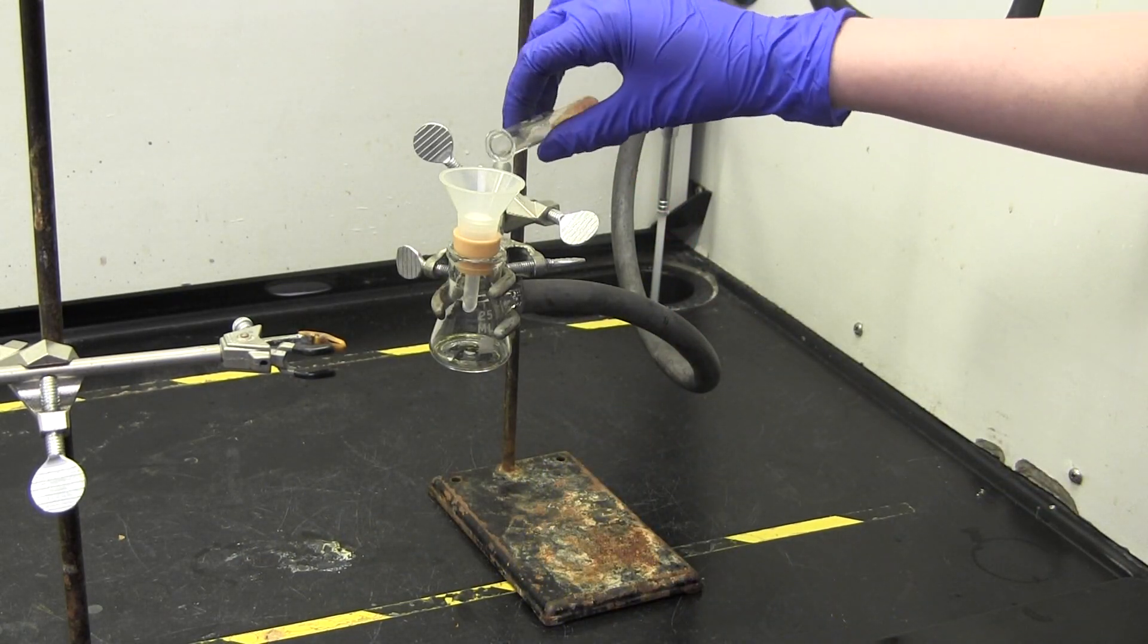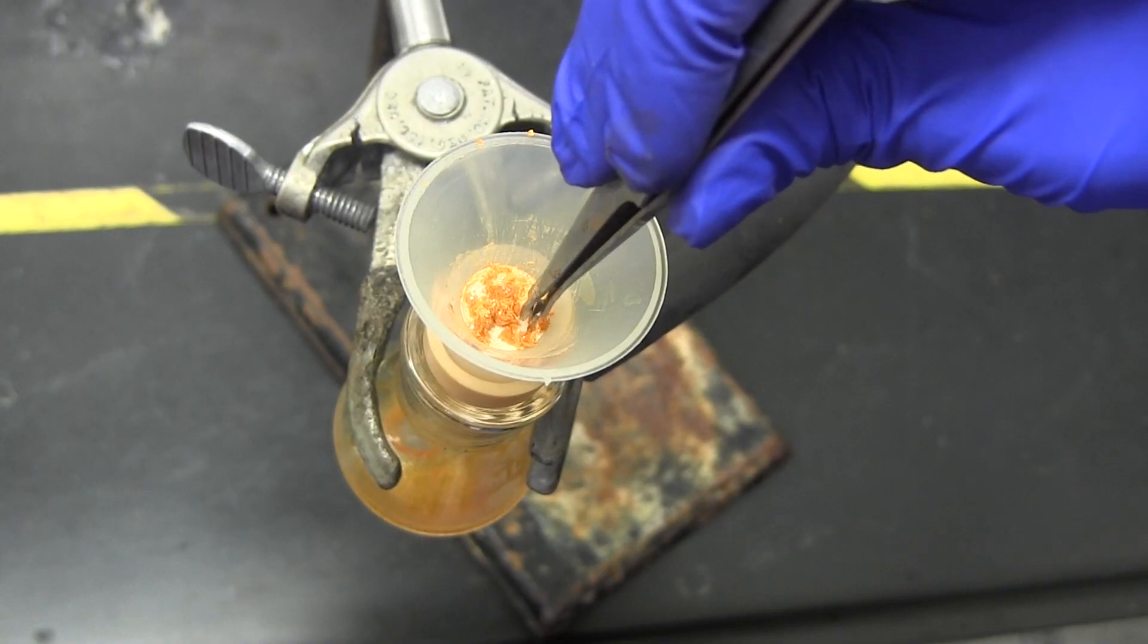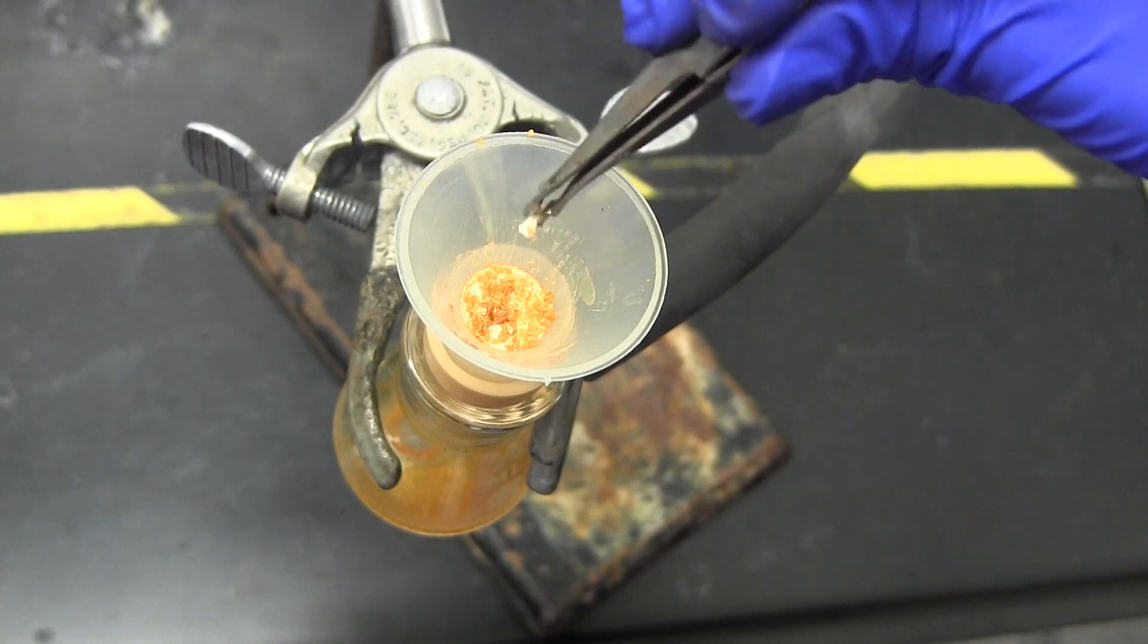Once the mixture has cooled, run it through the filter and use forceps to remove the boiling chip from the solid filtrate.